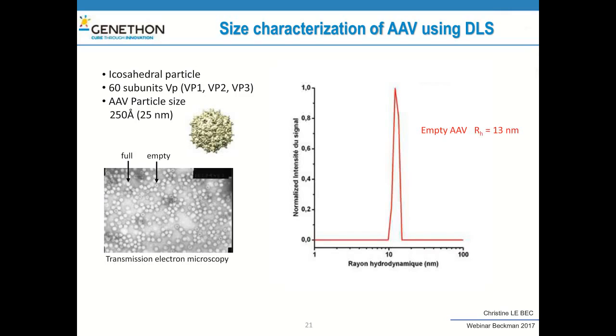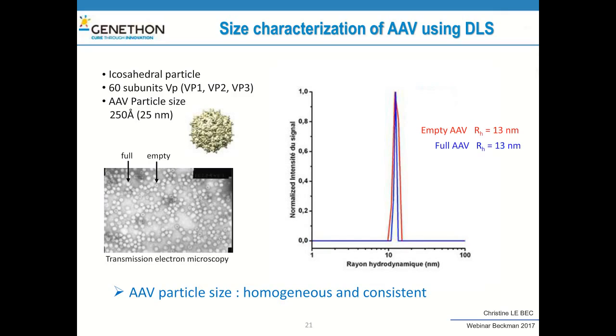And we also check by dynamic light scattering, and we verify that the size of the AAV particles is almost the same. As you can see here, in red, these are the empty particles, and in blue, only full particles. The diameters of these empty and full particles are consistent and almost the same, around 26 nanometers.